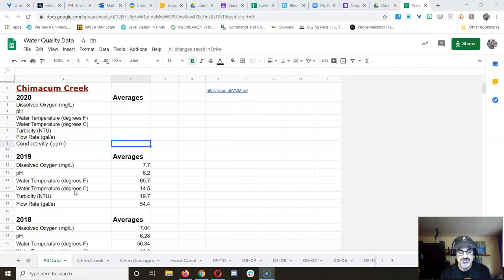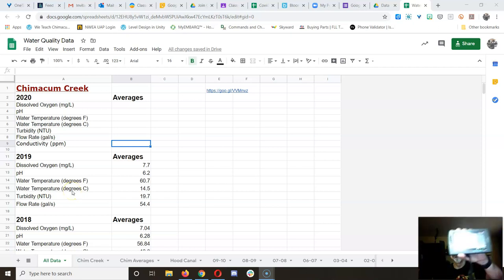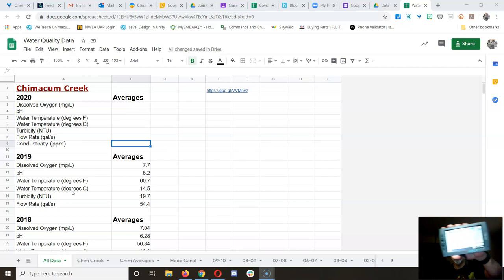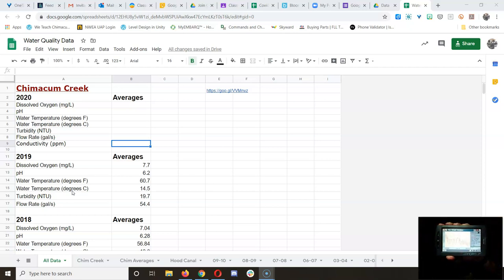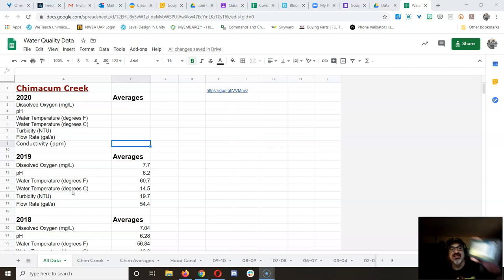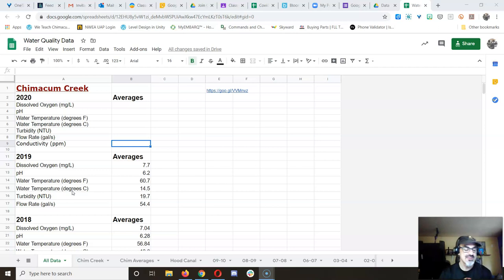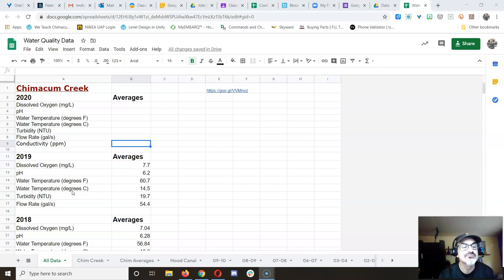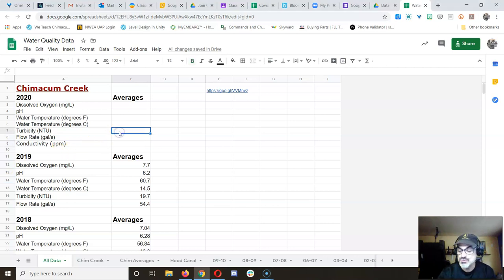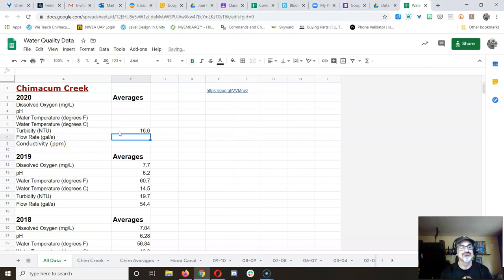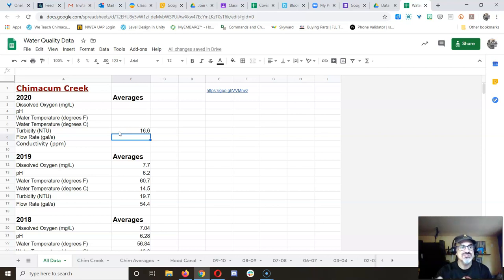Next, we're going to do, let's do turbidity. And you see, oh, you can't see that, can you? This is where I find it. So the mean was 16.6. Turbidity NTU, 16.6. And I mean, the next step is to learn what this stuff means.